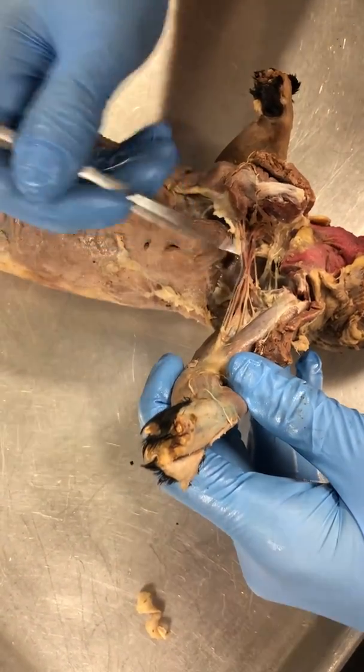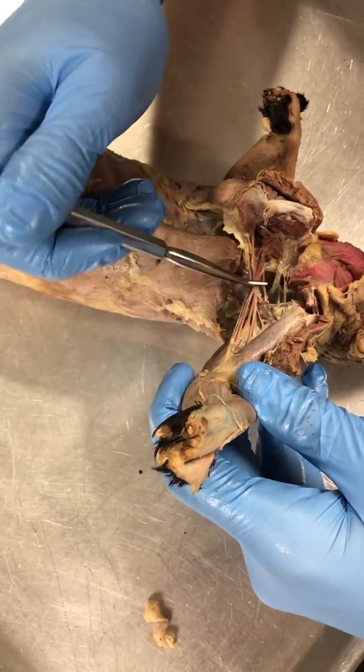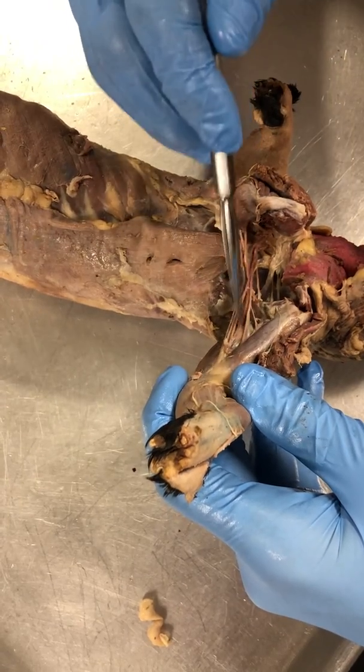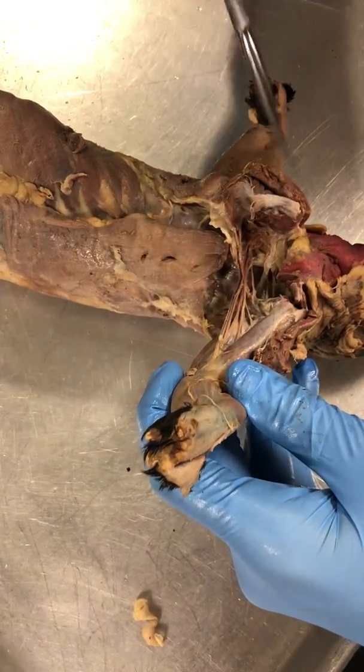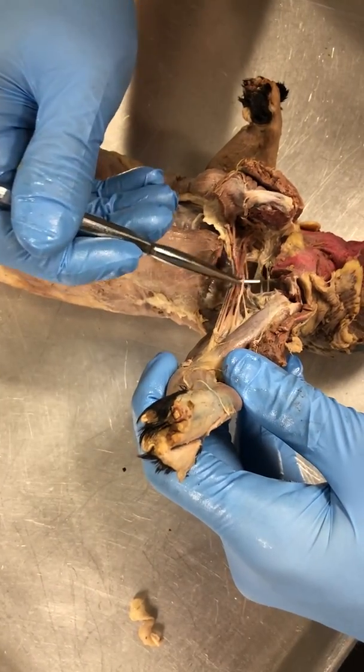So blue's veins, red's artery — they pump dye into them to help you identify. But we're concerned with the uncolored ones, the nerves. So, gently tease out the nerves with your probe. Break up any of the fascial tissue. But be gentle, because these are pretty thin, so we don't want to break these.